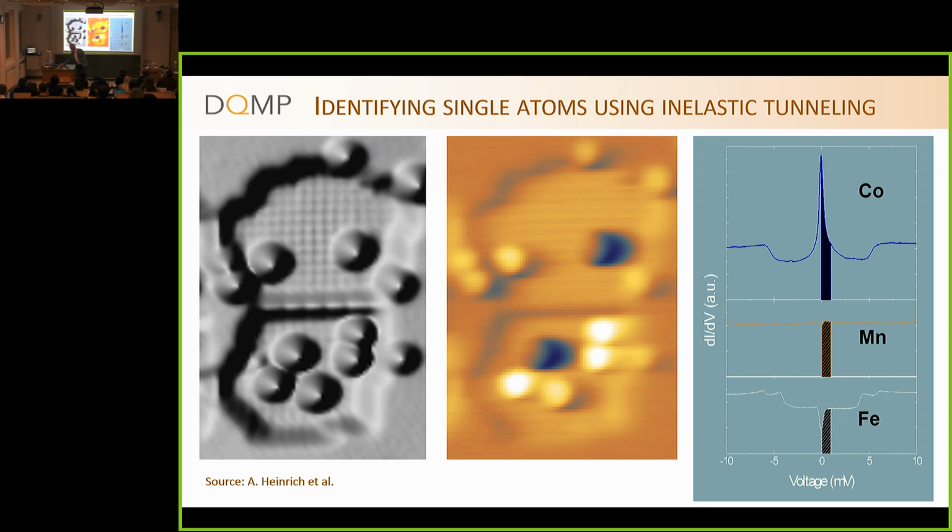Questions on spin polarized? That's all I had prepared for this part. This is still a field that is just expanding. So all these spin waves, skyrmions, many magnetic structures that are interesting at the atomic scale. People are starting to put efforts into them to study them at the atomic scale. And it can be actually quantitative in certain techniques.